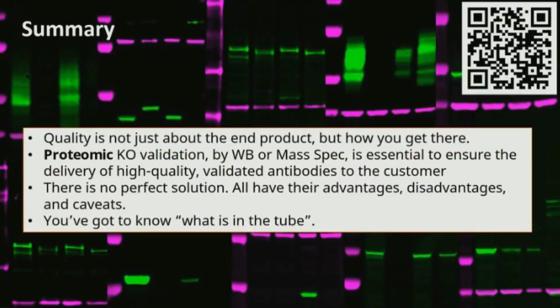And that's my summary. So, the little QR code at the top: I challenge you, while Alejandra is going to move me on, I've aggregated a load of different Western blots. Have fun while I'm talking, trying to work out which one's the truncation, which one's the insertion, which one's the fail, and there are some positives in there. But my ending message is it's not just about the end product, but how you get there, and making sure quality is embedded in your entire process in order to get the best product out at the back end.